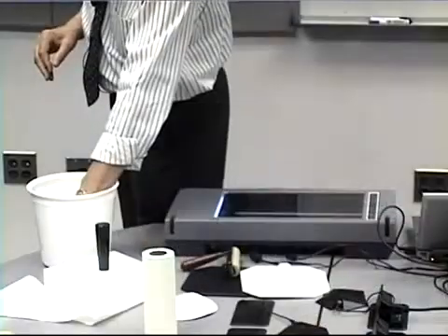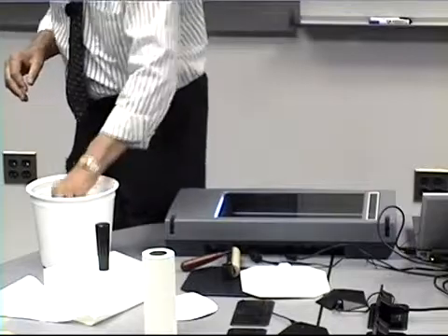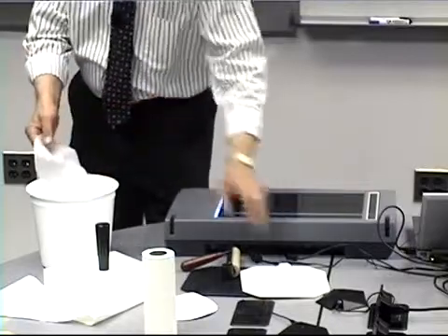In this particular case, we'll illustrate just what you can do with such a system. The writing is on the back of the hand sheet, and we'll dip it in the water, simulating the creation of the wet hand sheet in the hand sheet mold.